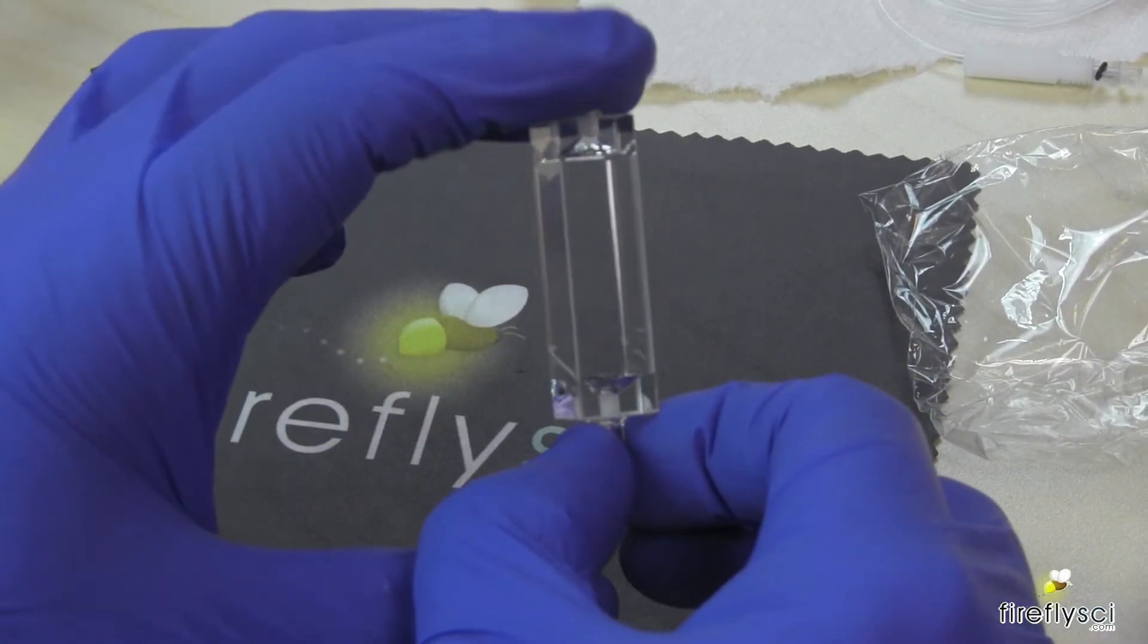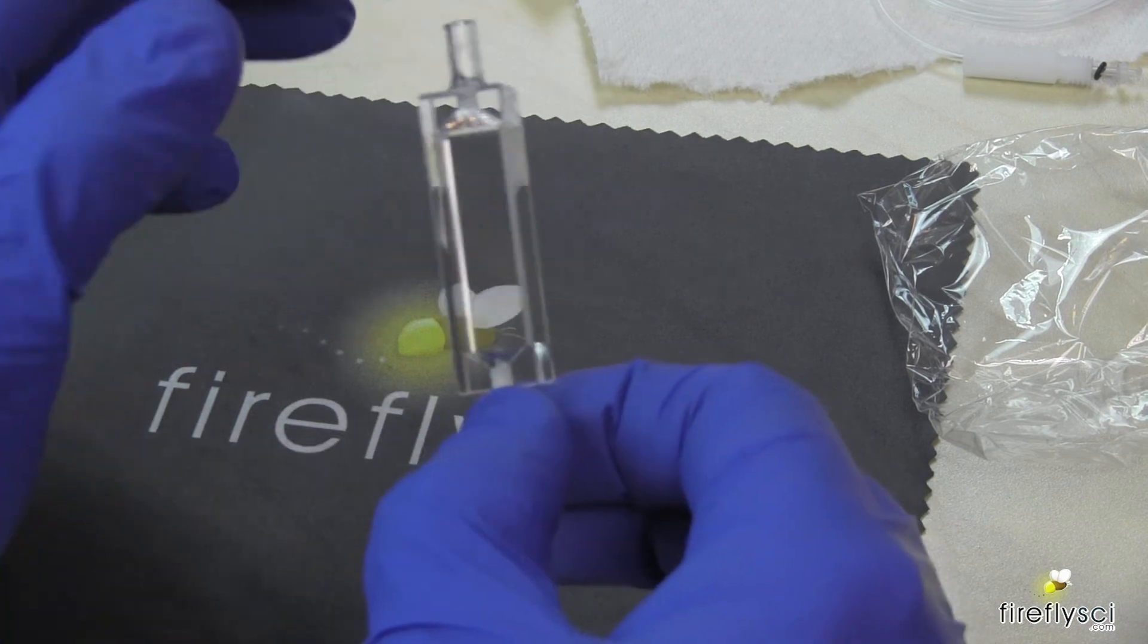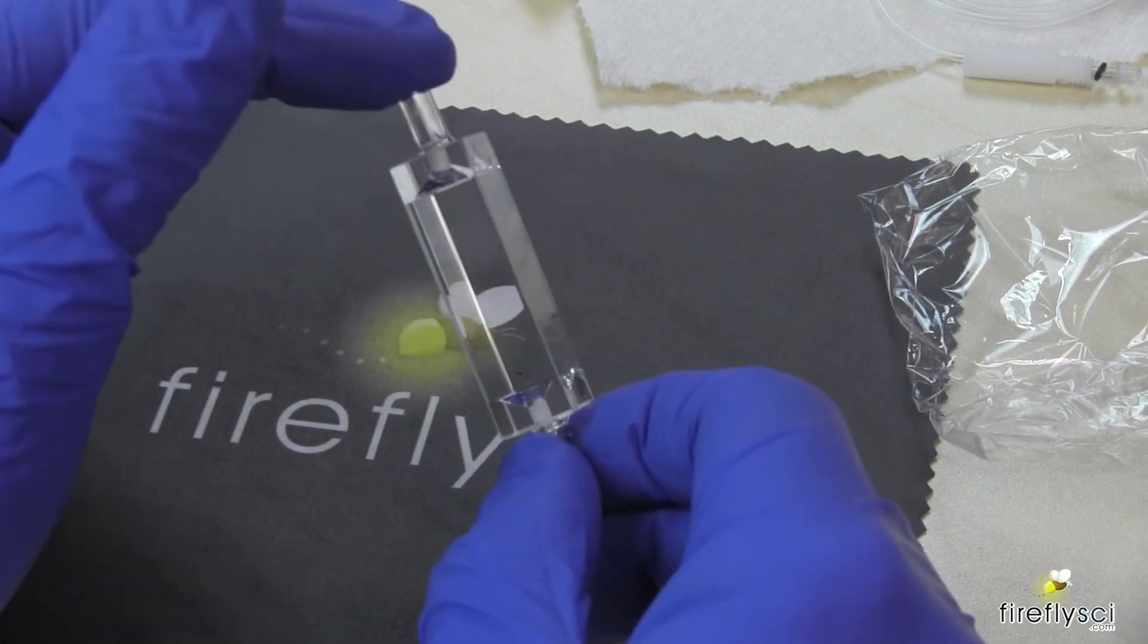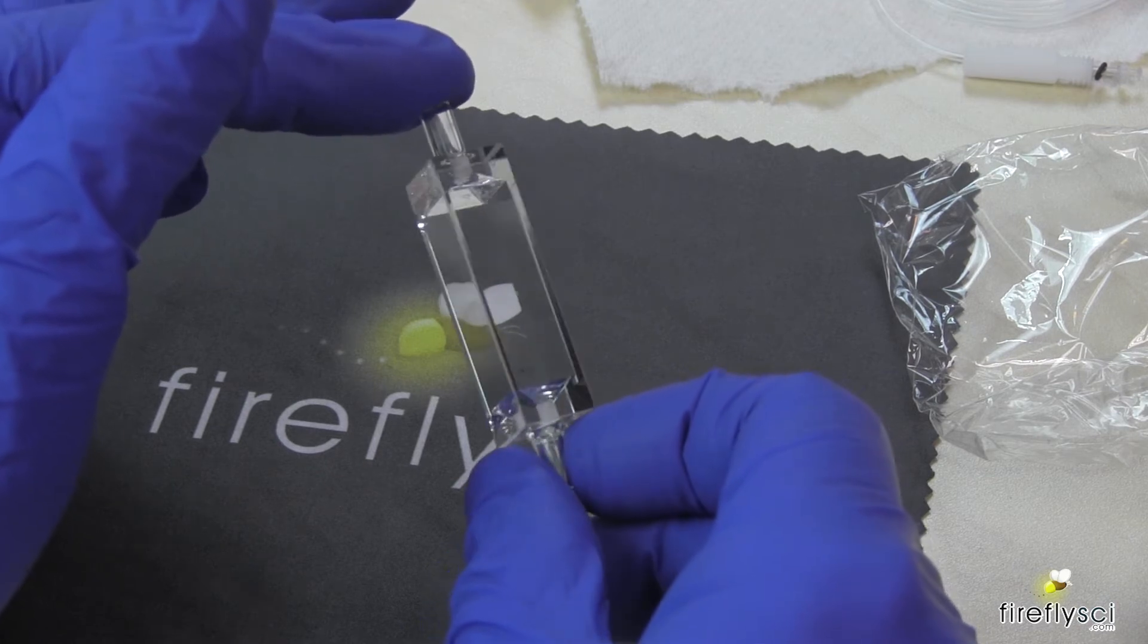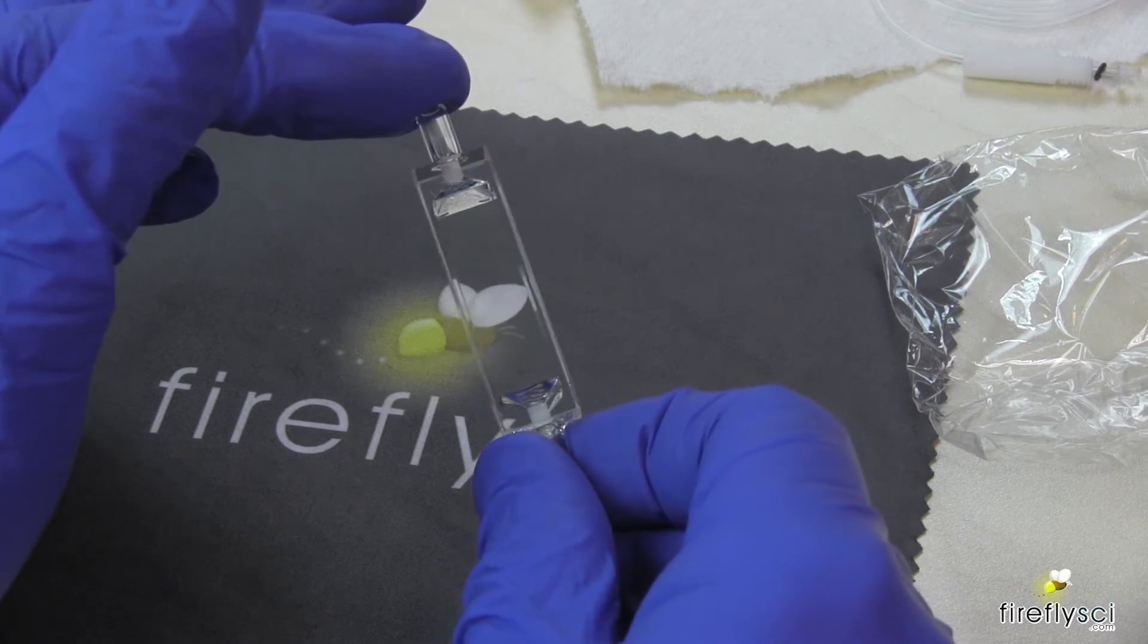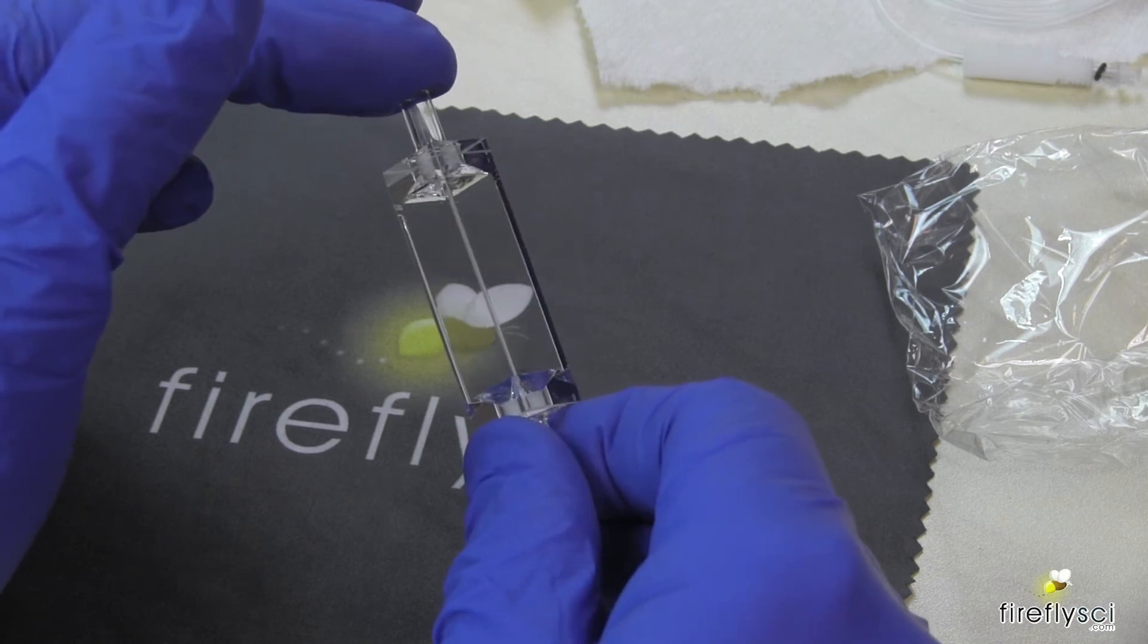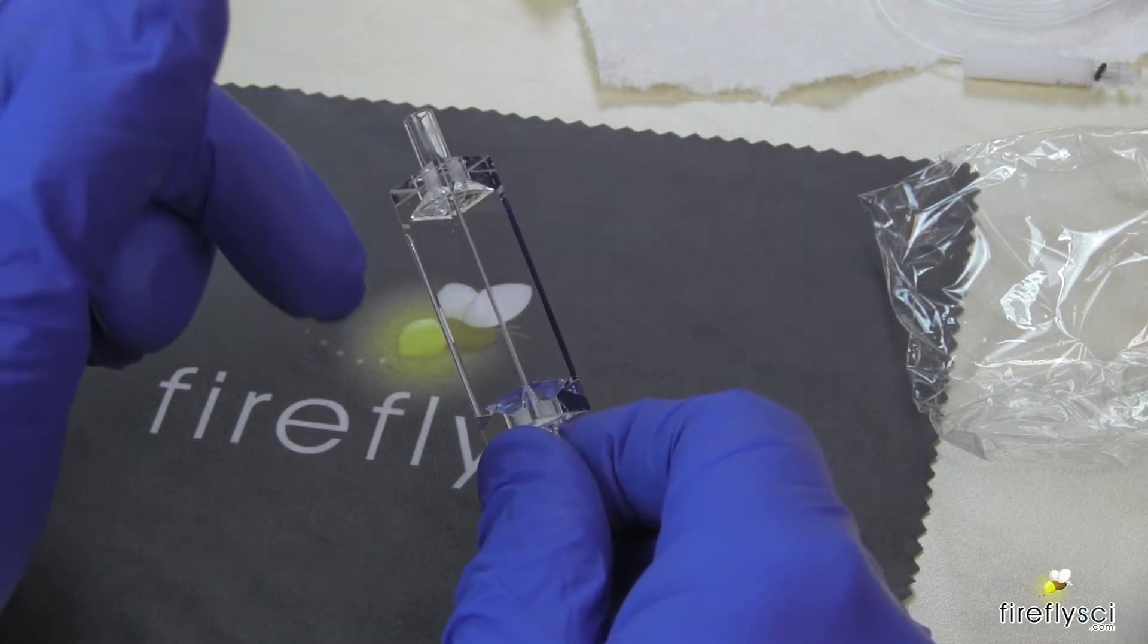And most flow cells have an inlet and outlet on the top and bottom, like this cell that we see here. This design is most popular since it allows a sample to easily flow through the cell in a smooth, turbulence-free flow.